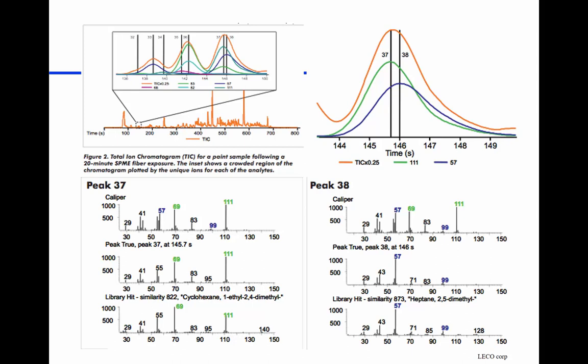I showed you this, so I won't bother to do that again, but it is our most powerful detector for a gas chromatograph. As I said, we can start measuring components under other components. And so we can actually not separate. That's interesting. We don't necessarily have to separate our compounds to measure accurately. Because, as I said, this is our total. This is what the machine would be drawing. But if we start looking at the mass spectrometer saying, okay, what ions are increasing here? What ions are increasing here? Where do those ions peak? Where do these ions peak? You can actually figure out what's moving together, what fragments are moving together. And you say, oh, these fragments moving together, they're one compound. These fragments moving together are another compound. So it's really neat. You can do quantification without separation. I like that.